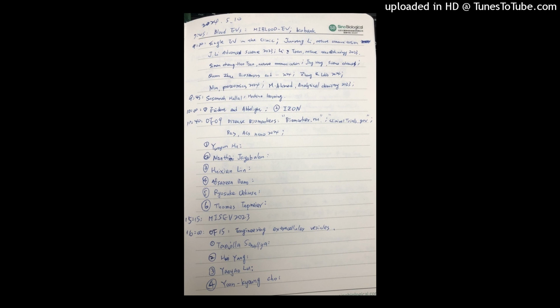Yeah, the amount of anticoagulant is quite tricky because usually we pre-inject or rinse the syringe with anticoagulant. But the amount of blood we can extract from a mouse varies a lot. Sometimes it's 200 microliters, sometimes it's 400. So the amount of pre-rinse EDTA, the blood to anticoagulant ratio, is not constant.